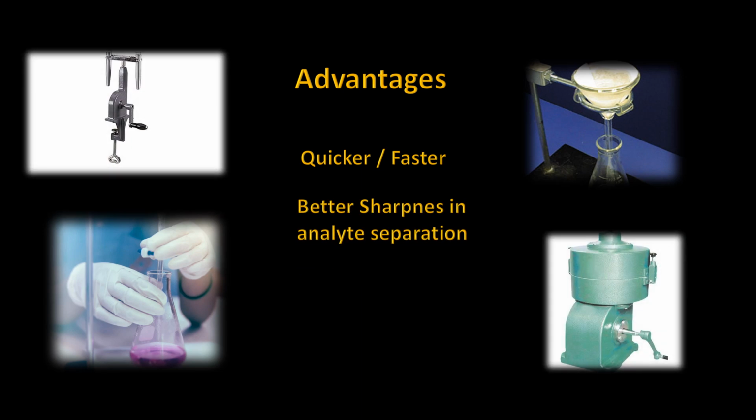There is also some efficiency as centrifuges may be used, compared to a slower filtration process. Small handheld operated centrifuges are available and are cheaper compared to a full-blown lab model. Smaller volumes means that less chemical quantity is required, which results in a lower cost per analysis.